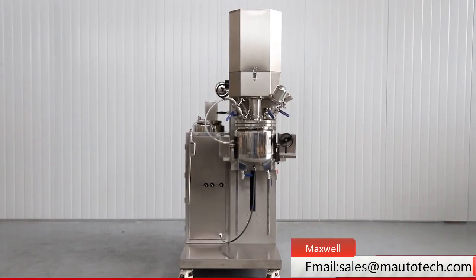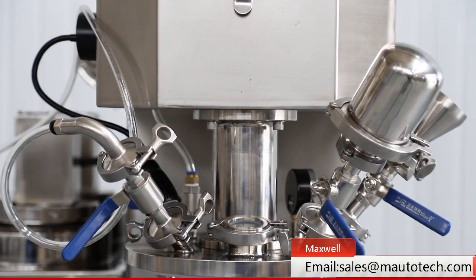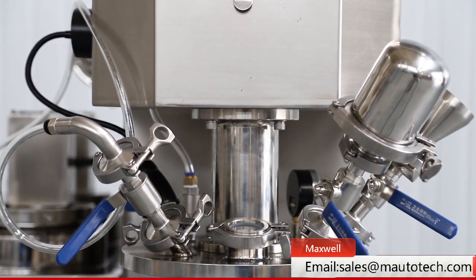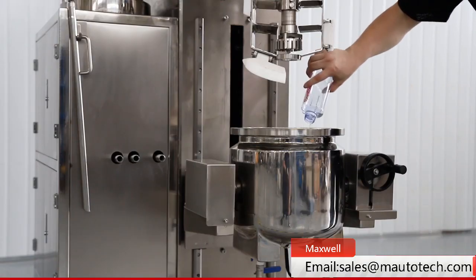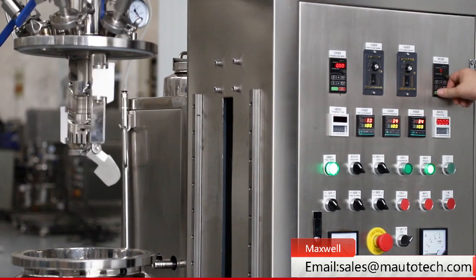This machine is called Laboratory Vacuum Emulsifying Mixer Unit. It is widely used in the cosmetics industry. It consists of three parts: vacuum emulsifying mixer main pot, oil phase pot, and water phase pot.